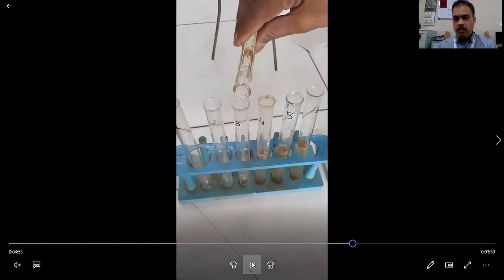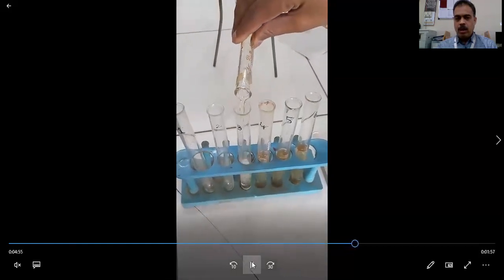For every test tube, we have to make up the volume to 10 ml. So we'll add into the third test tube. And for the second test tube, 2 ml filtrate and 8 ml of water.